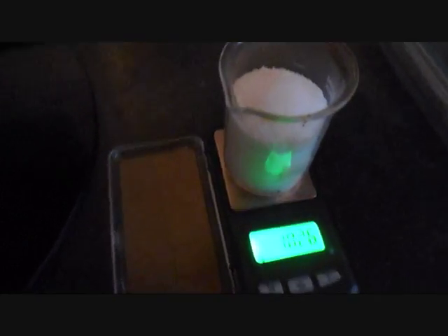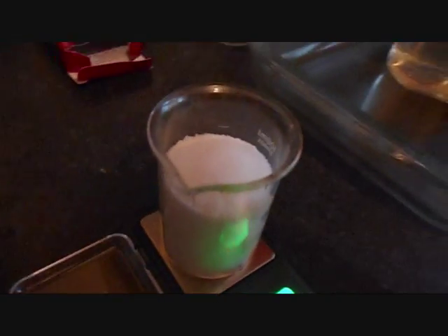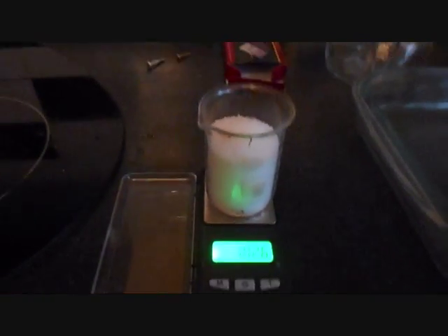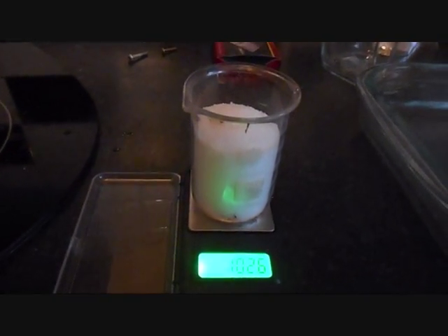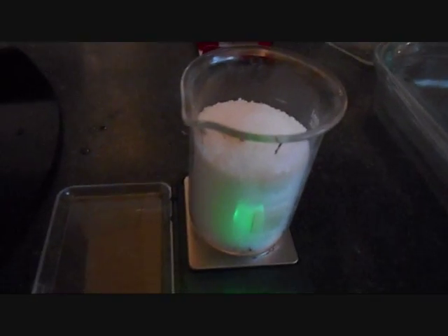Okay, this is, I don't know if you can see that, about 100 grams of caustic soda, which we'll be adding to this liquid in about an hour's time. So there we go, that's each way out.